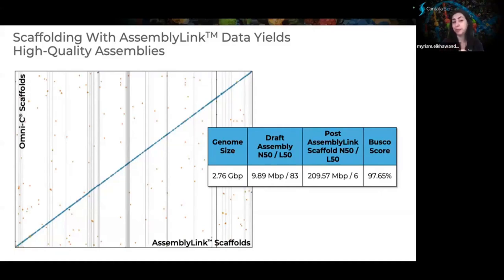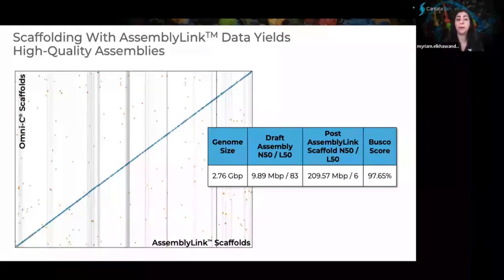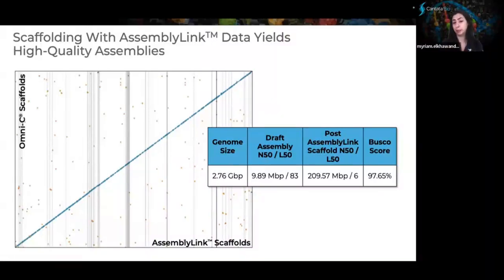What you're looking at here is a pseudohaploid assembly, meaning that the two parental haplotypes were collapsed into a single version. So in your final assembly, you have one haplotype at heterozygous loci. What the community has been working towards now, and this is picking up more and more, is haplotype-resolved assembly, where you actually have two independent assemblies of the parental chromosomes, and that is the true representation of your sample genome.